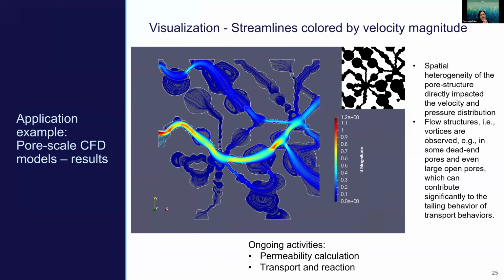I'm going back to what Janshu said in the beginning about diffusion, because in a real system, that's when diffusion is going to play a role to fill those isolated pores, depending, of course, on the moisture content you have in the soil. But I don't know how you can make that happen in the simulated form that you have right now. Is anything in the toolbox able to simulate the diffusion process here?